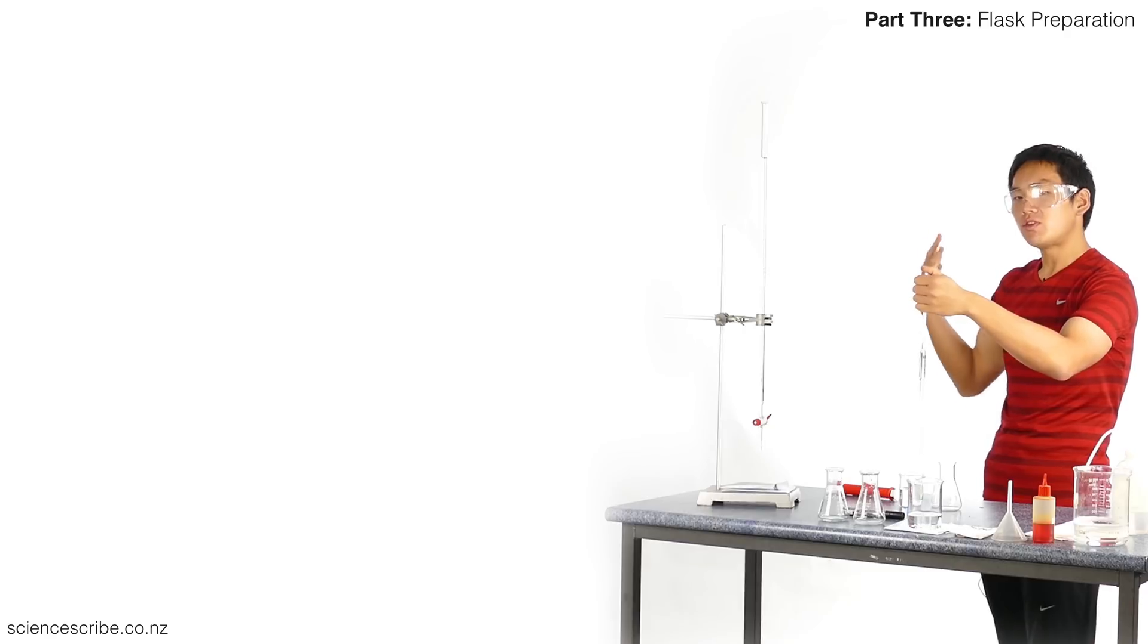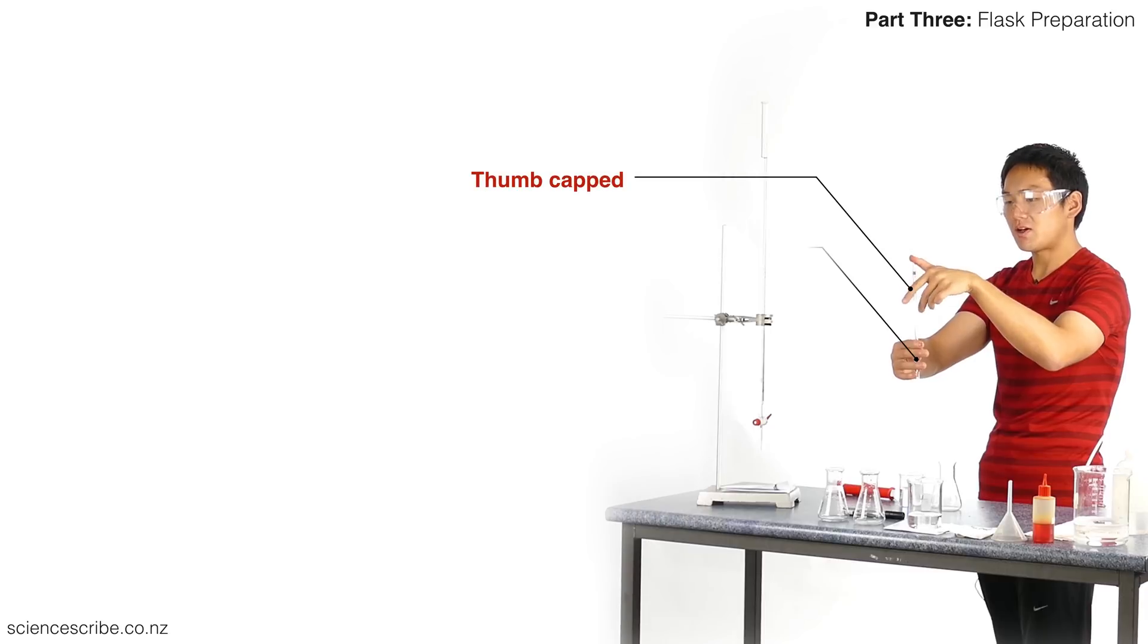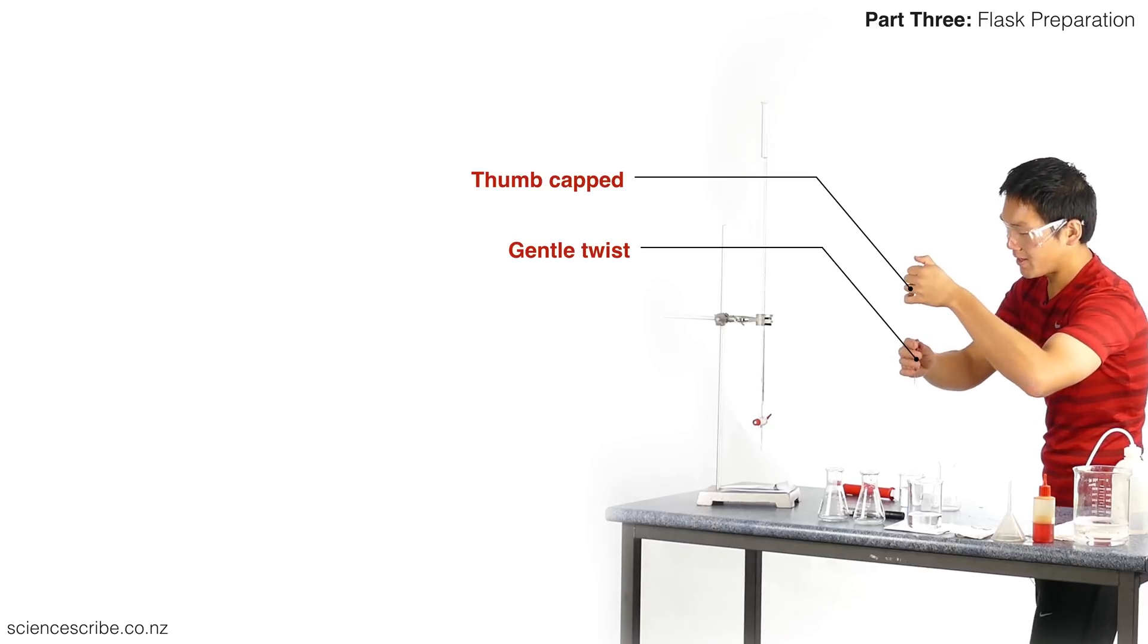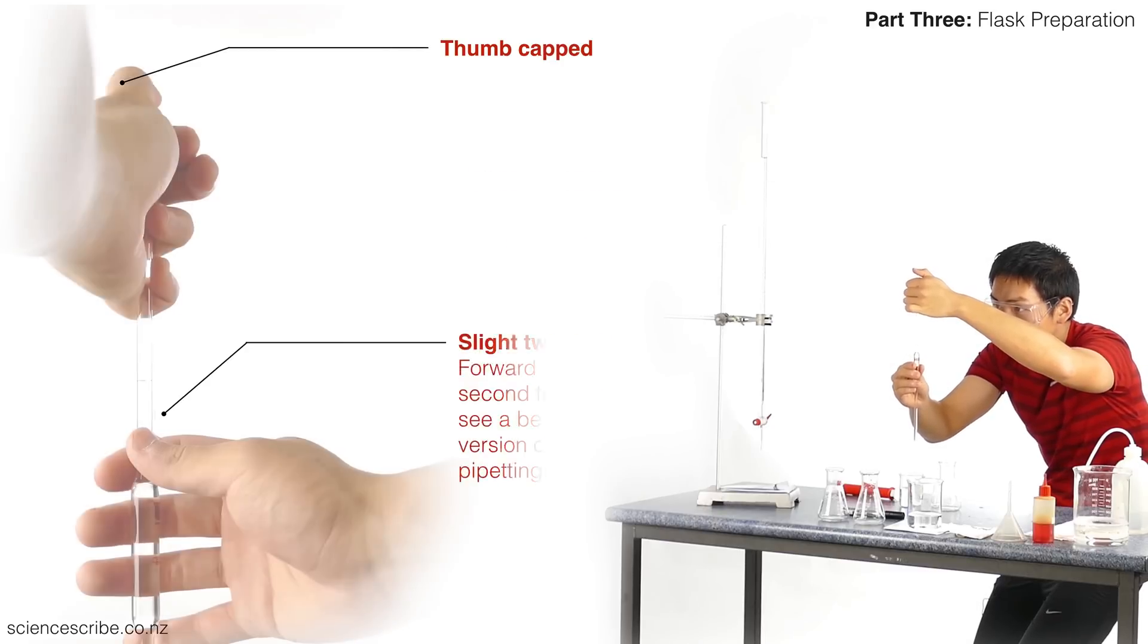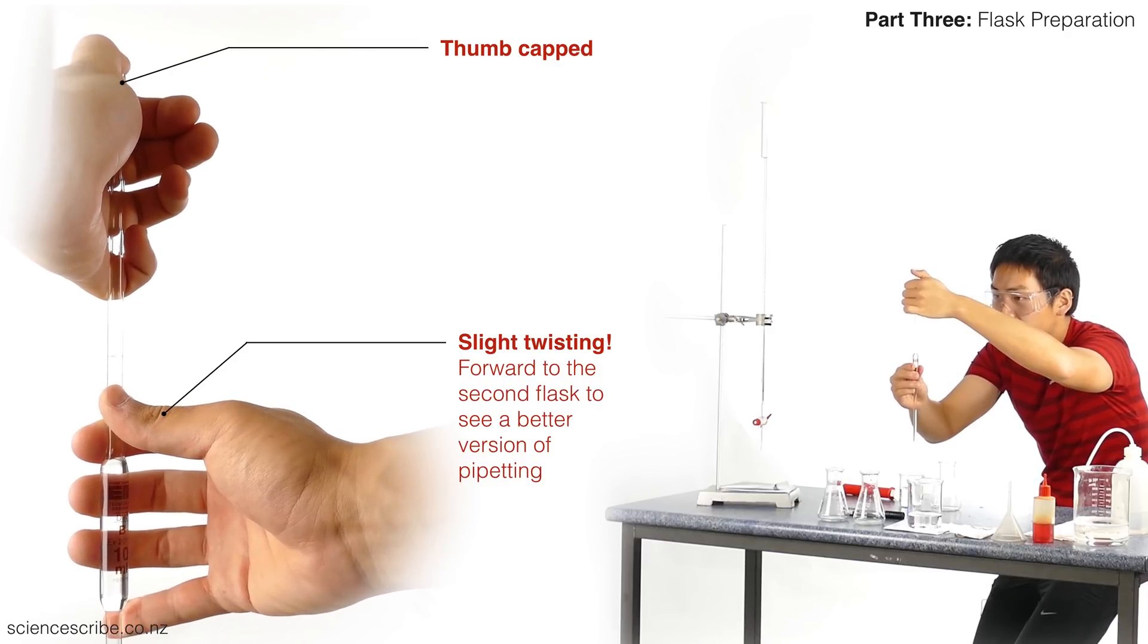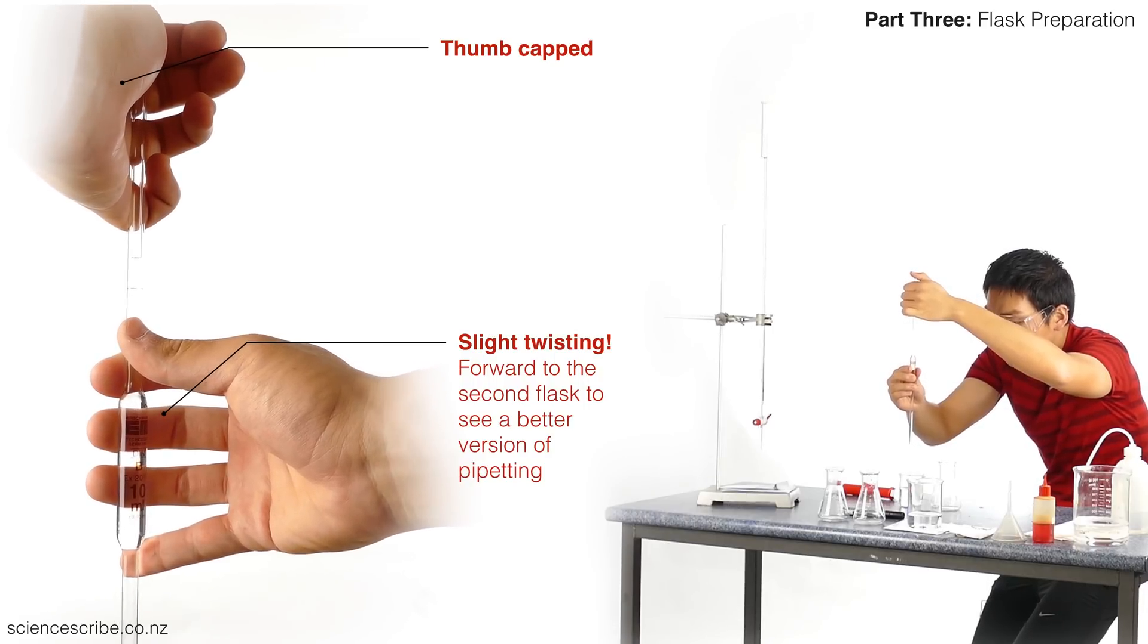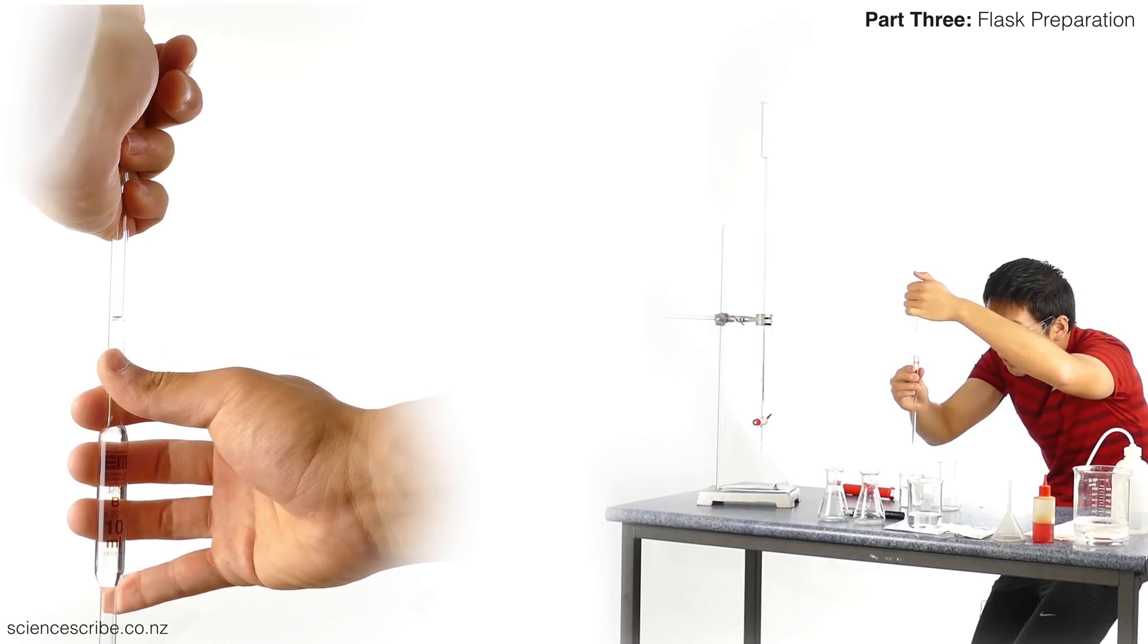My goal now is to hold on gently with my thumb over the top, and I'm going to use my other hand to twist very slowly until this liquid slowly falls and until that meniscus sits just on top of that line. This is the fun part—it's also the long part. This is where titrating or pipetting becomes an art form. As long as I twist and open a hole, as long as I have some drainage, then I'm not going to twist very much. I don't want to open it up too much or accelerate the draining. As long as it's a steady drain, it's going to be easy for me to suddenly stop the draining once the meniscus sits on top of the line.